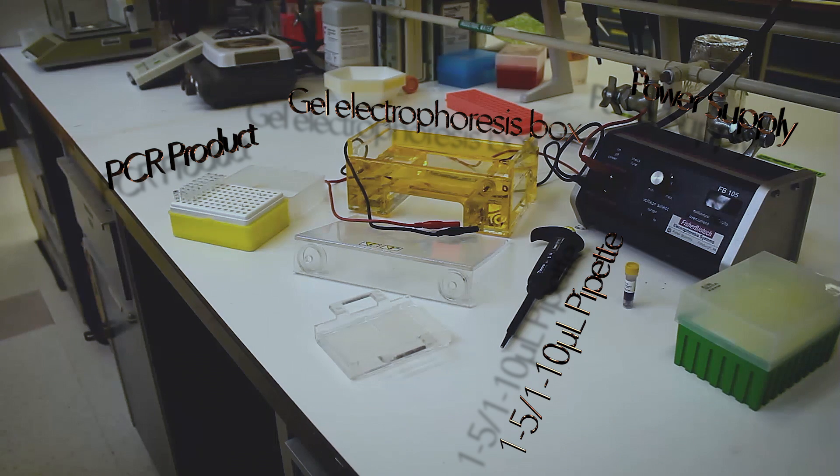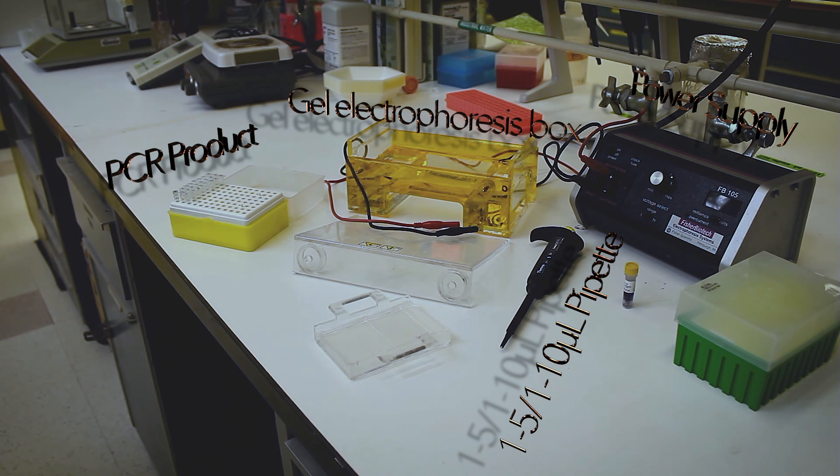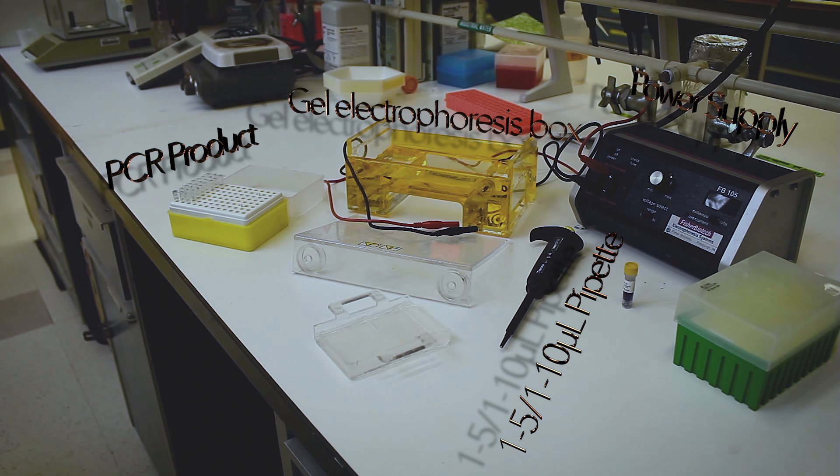To do this we will need PCR product, loading dye, DNA ladder, 1 to 5 or 1 to 10 microliter pipettes, TBE or a similar buffer, a gel electrophoresis box, an electrophoresis power supply, and an agarose gel.